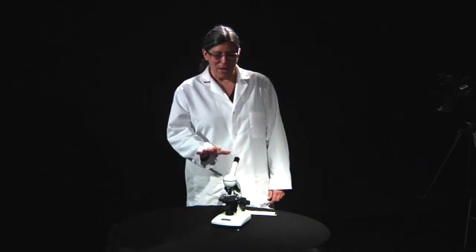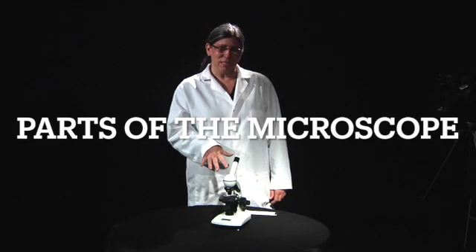Hi, my name is Dr. Randi Papke, and I'm here to step you through how to use the microscope that came with your lab kit. Let's start out with learning the parts of the microscope.